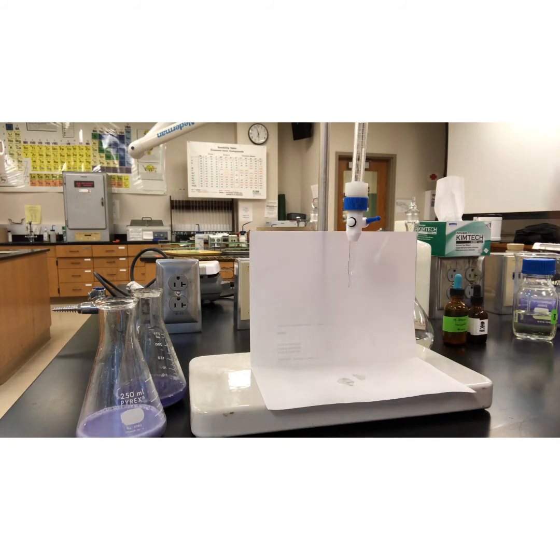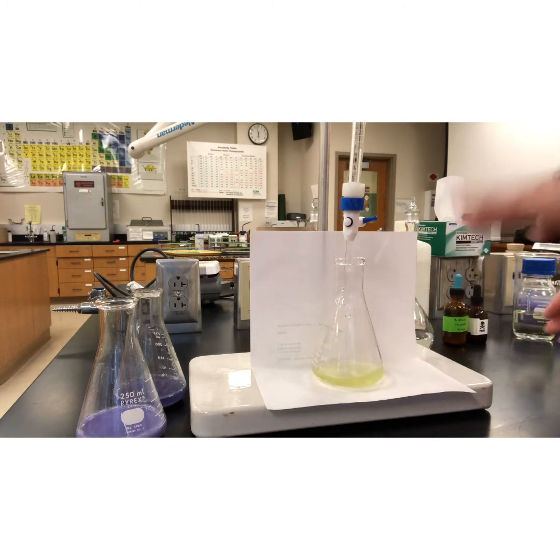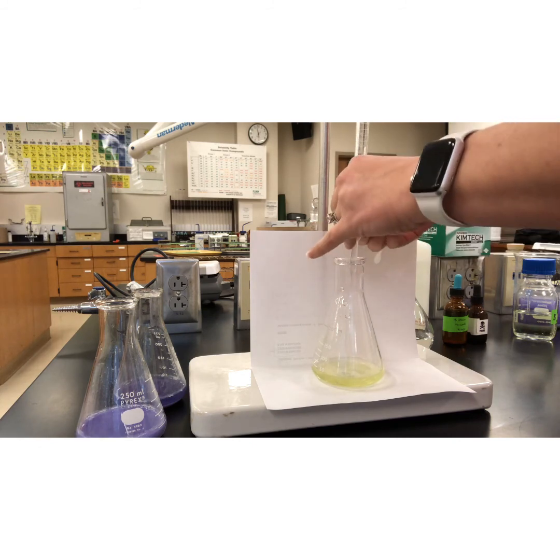V naught is 0.31 milliliters. Have a volume change of 19.8 milliliters. That last run was on the money. We caught it just at that faintest bit of a color change. Here we go.